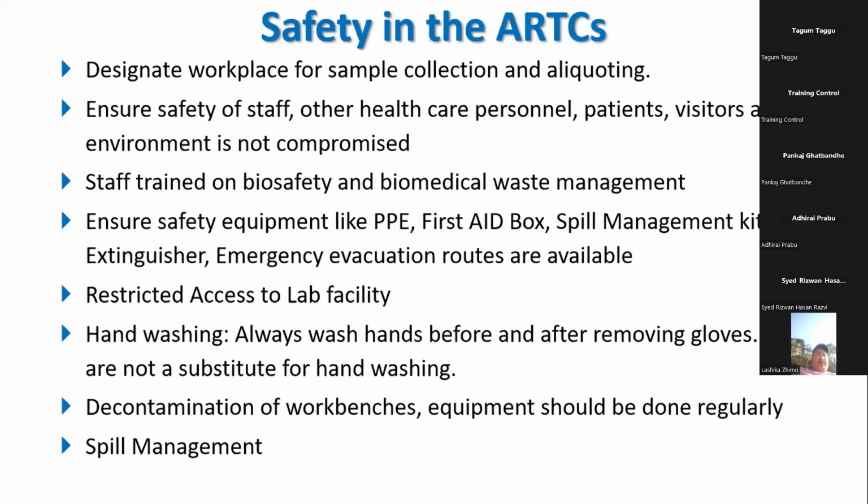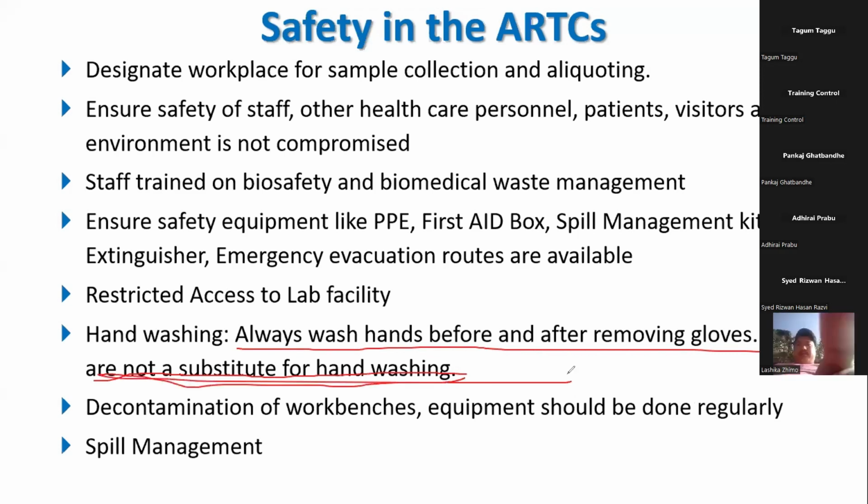Make sure you have enough PPE on you, that is your gloves, mask, face shield, apron, or whatever it may be. Hand wash, which is beautifully addressed here. Always wash your hands before and after removing gloves, as gloves are not a substitute for hand wash. COVID has taught us very clearly how important hand wash is, especially in the healthcare sector where we are dealing with infectious diseases. This plays a crucial role. So make sure hand hygiene is followed.